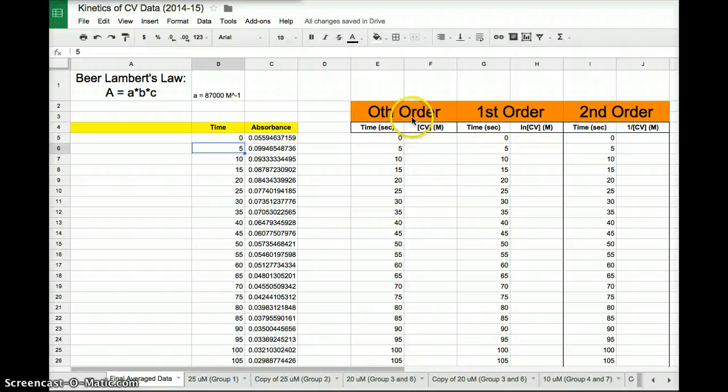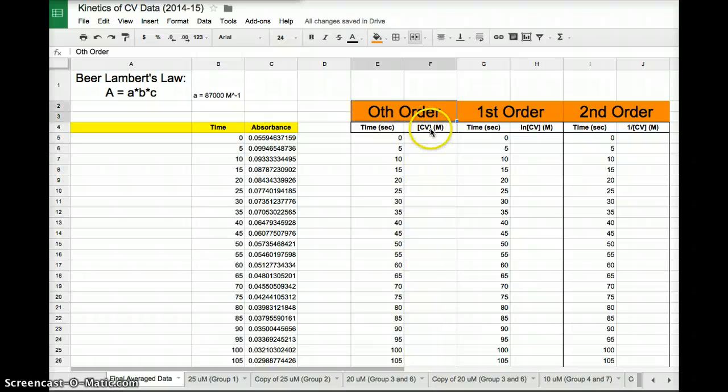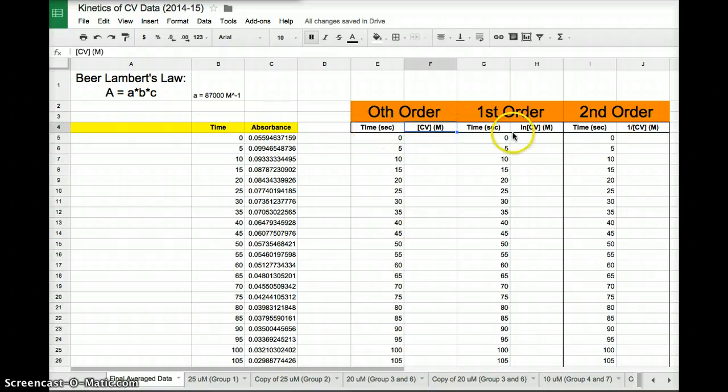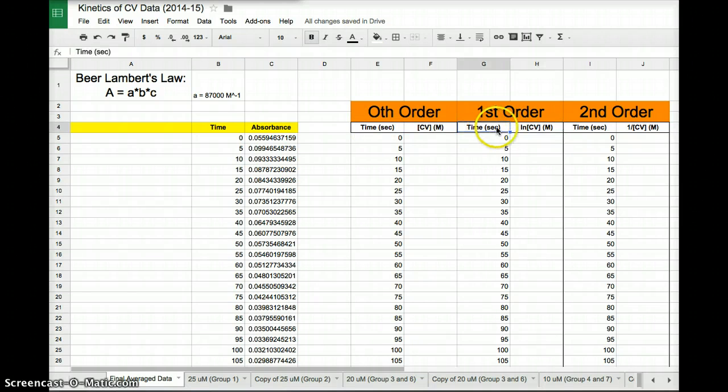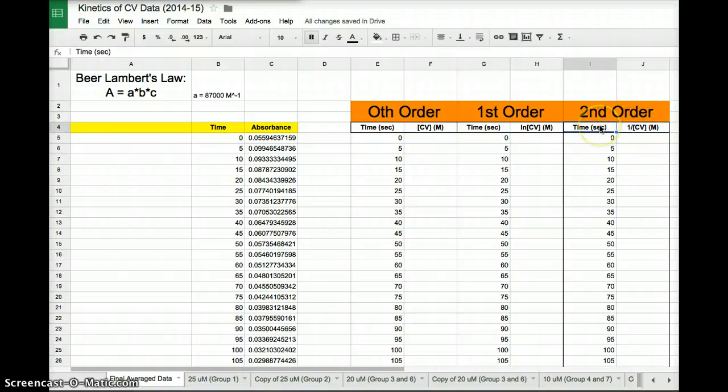What we want to do over here on the right eventually is to create three different plots. One for the zeroth order, which we know is concentration, so I put concentration here of CV versus time. First order, natural log of concentration versus time. And second order, one over concentration versus time.